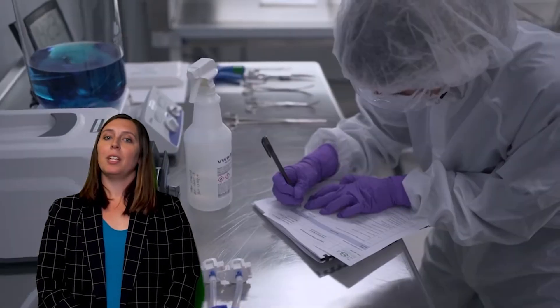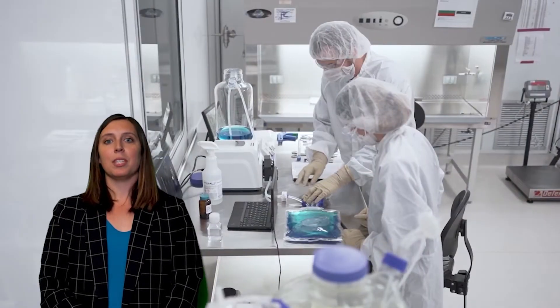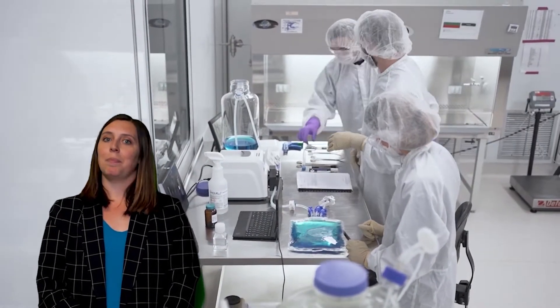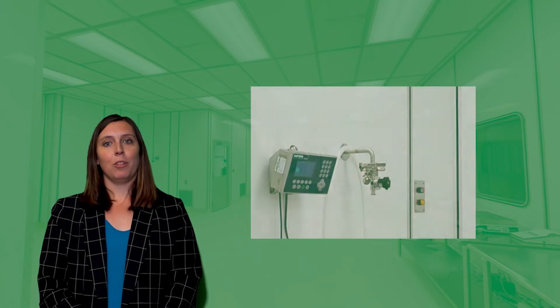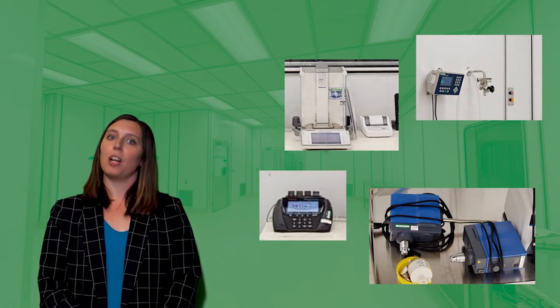The people formulating the medicine are professionals that receive in-depth training at BSM. You'll see in the room water for injection ports on the wall and a collection of balances, mixers, pH meters, and other equipment used in the manufacture of the drug product.